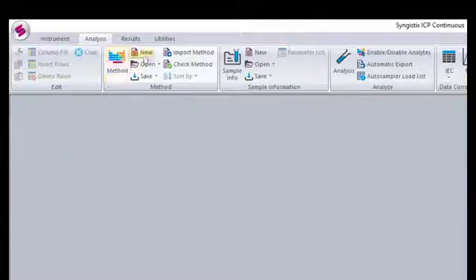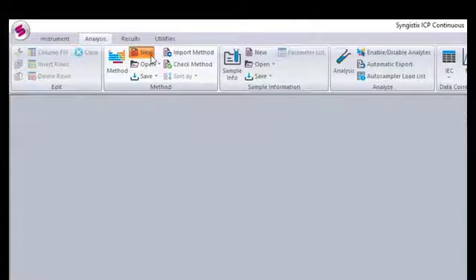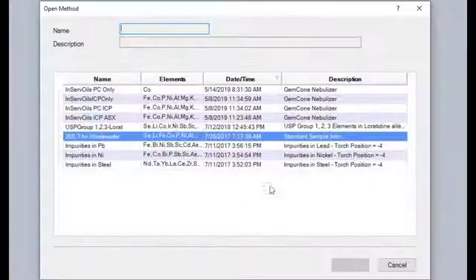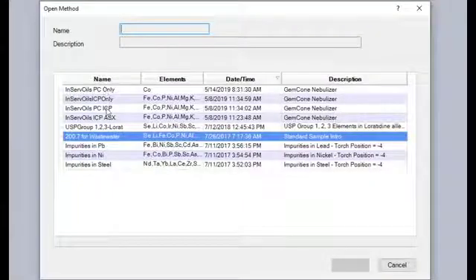A number of predefined methods have been provided for the combination of ICP and particle counting. These can be accessed by selecting new method and selecting copy of predefined method, the most often used being the in-service oils PC ICP method.